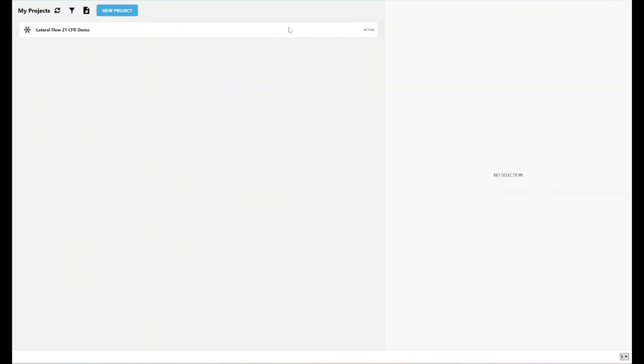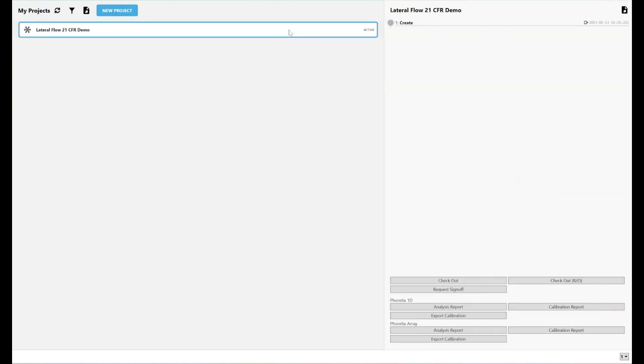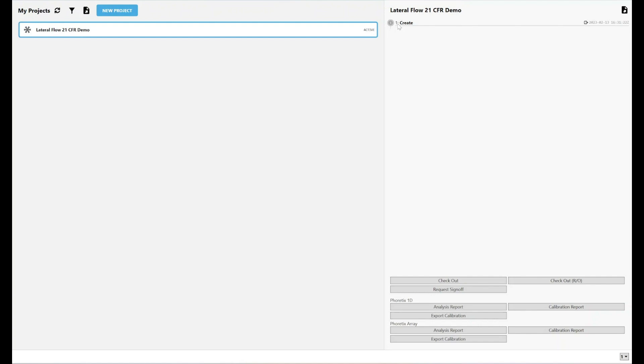As you can see, this project has now, the audit trail has started to begin. I've created the project. This is an active project. Here's the date and timestamp. And the one here in the grey circle means this is the first revision of this project. The one here is the username of the person that created the project. The project now exists in the secure folder in a secure state.